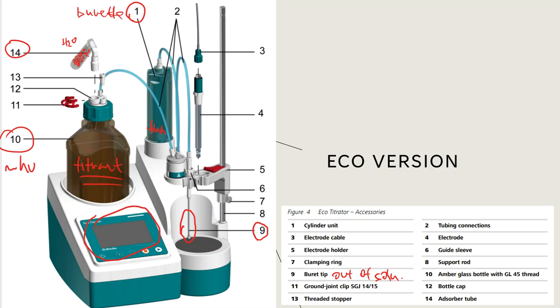So what goes on is that we put an absorber on, and that absorber absorbs all of the water or maybe contamination that can make its way into that jug and mess with our titrants a little bit over the course of time before we deplete it and before we use it all and have to refill it. So it just stabilizes the titrants for us from day to day activity.